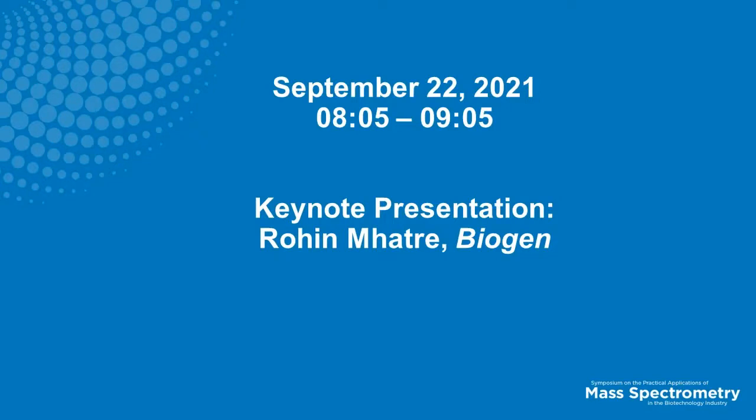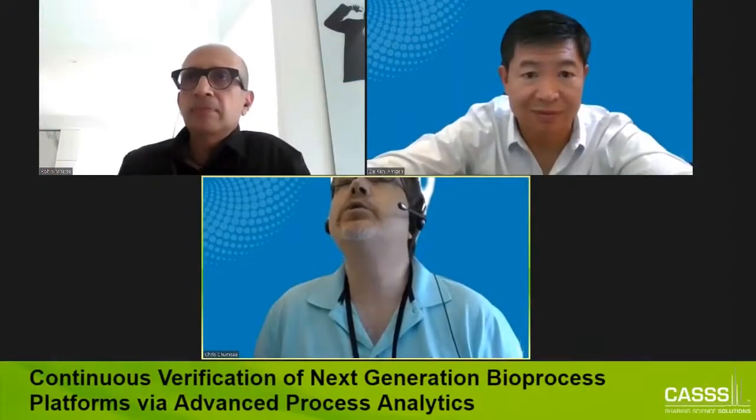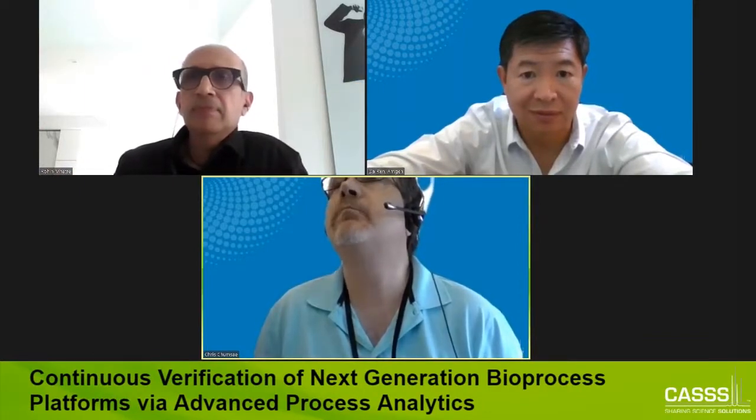Excellent talk. So we have a question. Since multi-attribute mass spec methods can generate rich data on product quality attributes, have you been able to incorporate MS data into the multivariate predictive models of process performance?